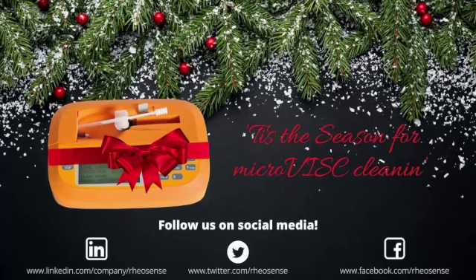If you're interested in learning more about the syrups and how they behave, we do have an app note that you can download. We'll go ahead and share a link to that app note. I'm not exactly sure, or at the end we'll tell you where you can find it. So let's go ahead and measure this, and as soon as it's done, I'll let you know what the viscosity of this second syrup is.